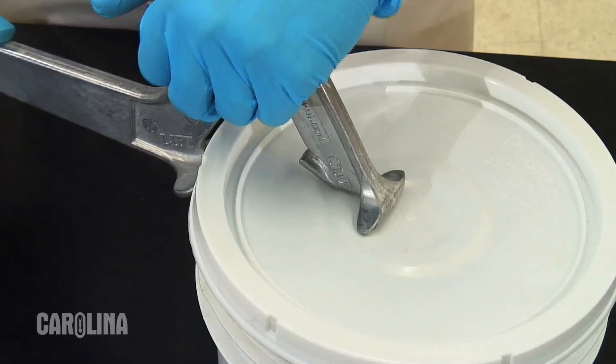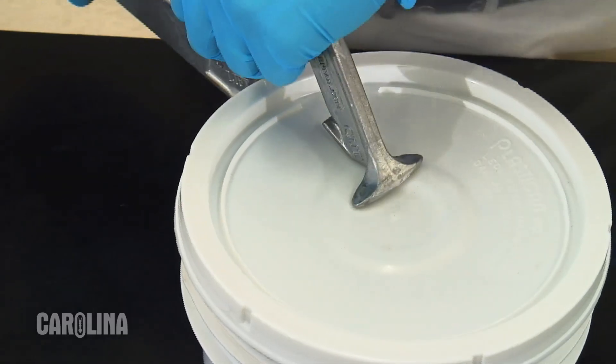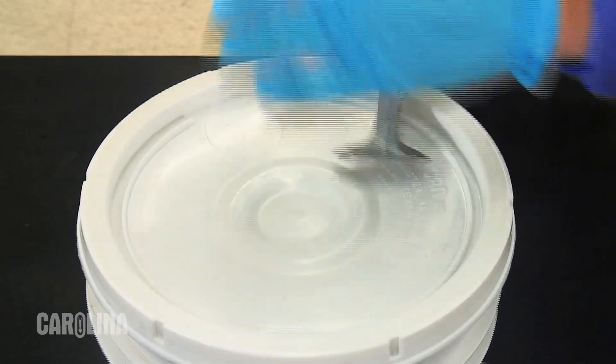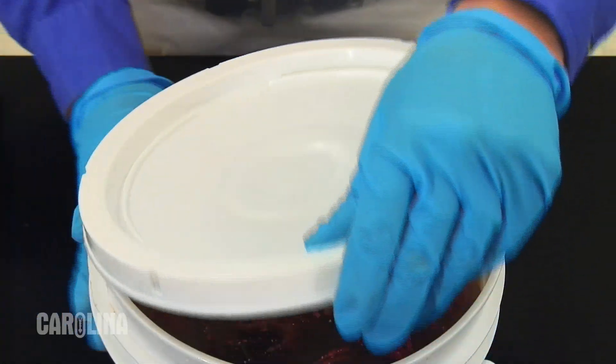Our pails are sealed tightly to prevent leaks during shipping, but with the right tool — the Carolina Pail Opener — opening them is simple. You only need to apply a little pressure with the pail opener to open the pail. Slowly work your way around the rim, sometimes as many as two to three times, and pry the lid up.